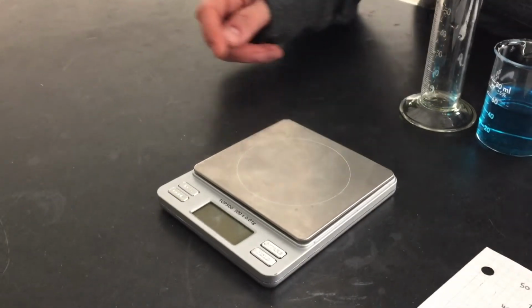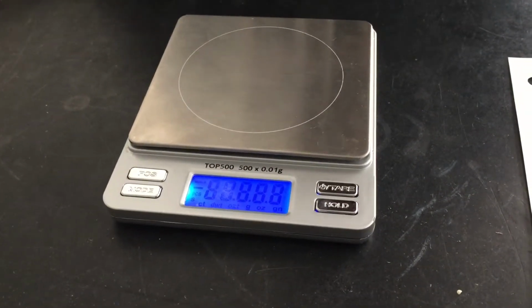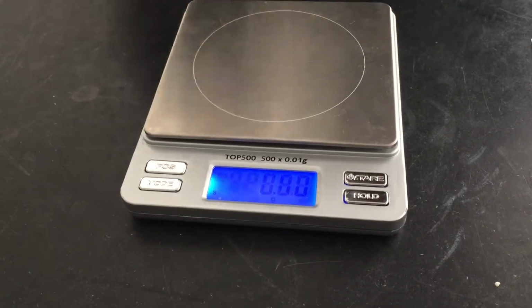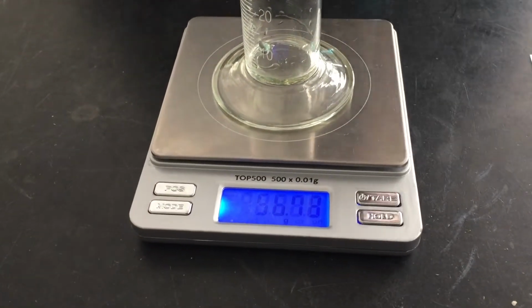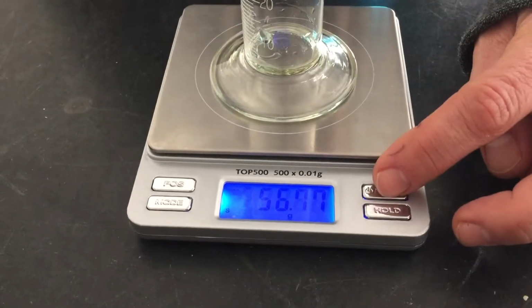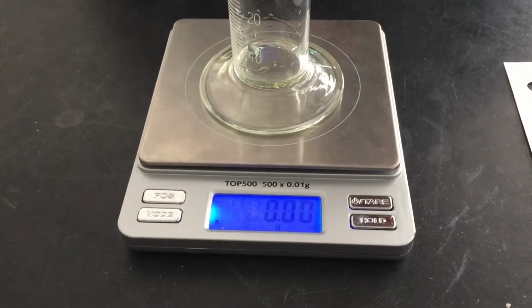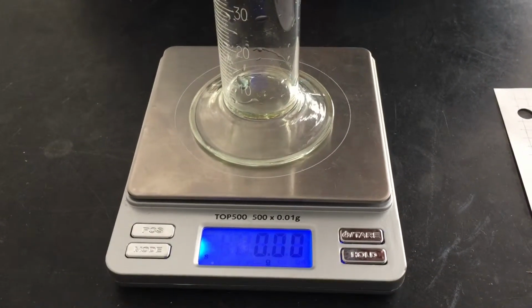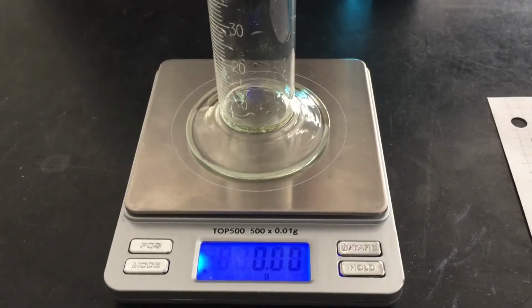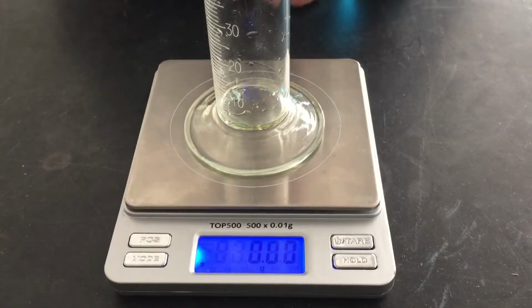Okay, so this is what you guys are going to be doing for the lab. The first thing you're going to do is turn on your scale, wait for it to zero, and then place your graduated cylinder on it, wait for that to settle down, and then tare it. This will create a zero reading on the scale. And now the next step is to record several different volumes of liquid and record the mass of the liquid.